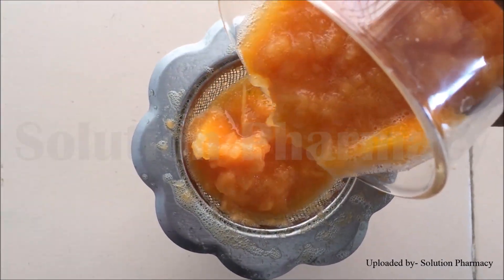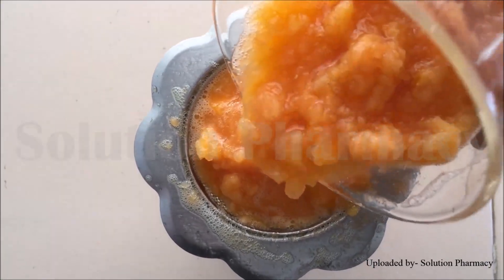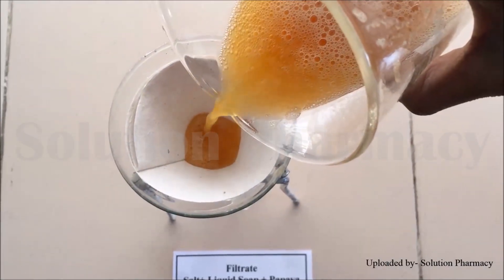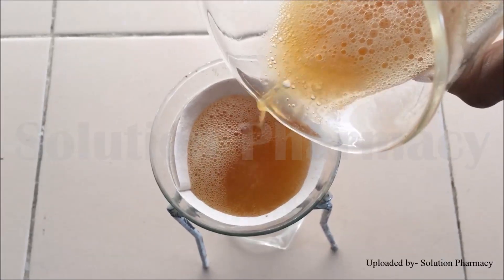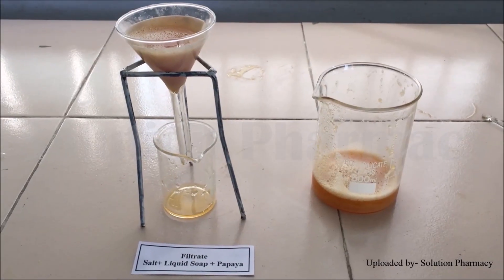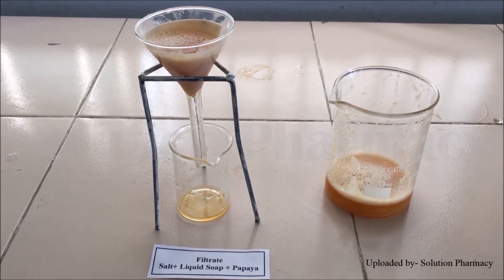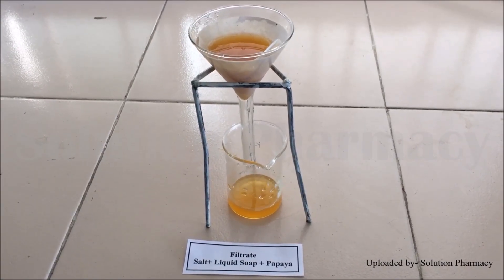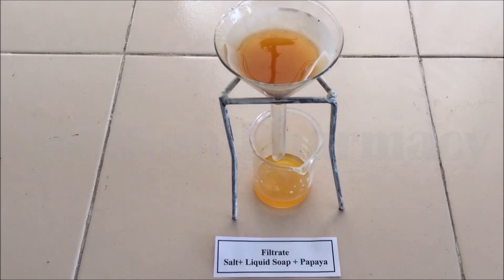After crushing all the pieces of papaya, transfer the crushed papaya into a beaker and filter it through a tea filter to remove the pulp. Discard the pulp and collect the filtrate. Then filter the filtrate again with normal filter paper to remove remaining fiber and pulp, obtaining a clear filtrate.